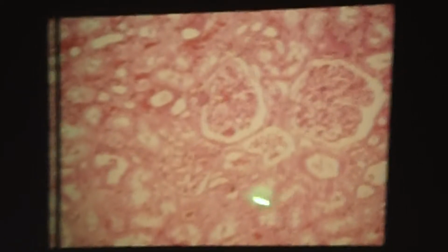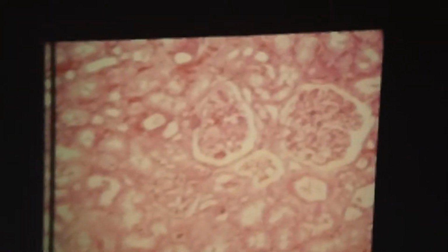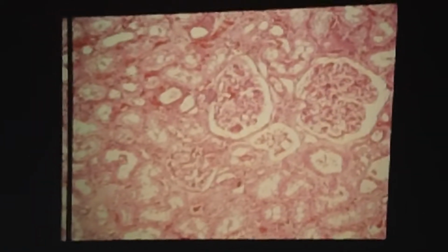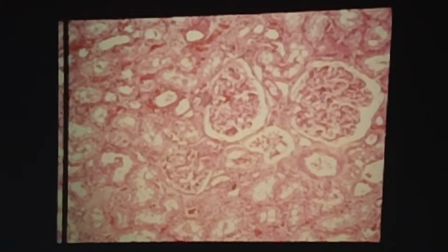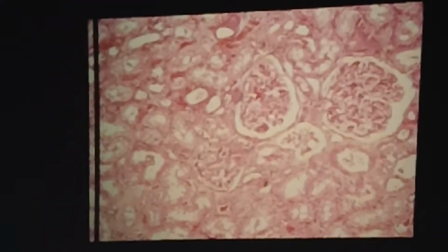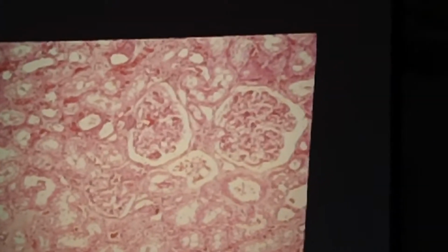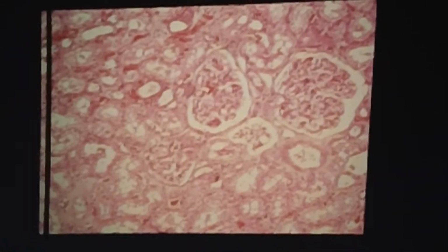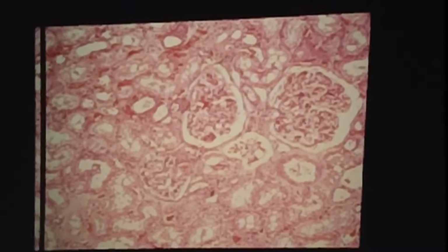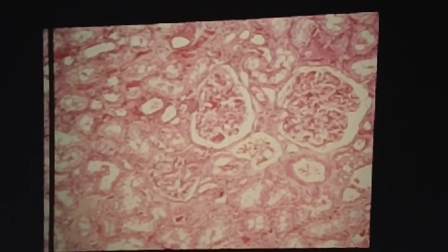Right, cortex, because we clearly got the corpuscle. These tubular profiles belong to what? Surrounding the renal corpuscle? So what tubules? Proximal. Sing it out, convoluted. I'm a deaf old man. Proximal, distal convoluted tubules. Yeah, no trick question, just lay it out.